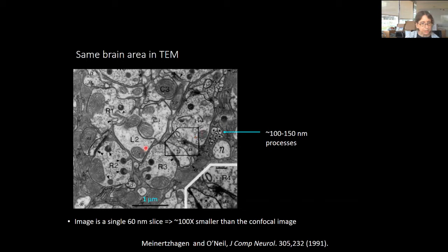So in this case, this is in the lamina. It's one of the least crowded places in the fly brain. This L2 labeled thing is the red cell that we labeled before, and synapses are these little black blobs called T-bars. But what we need to focus on in this picture is what are the smallest things that might be in our voxel along with our labeled elements.